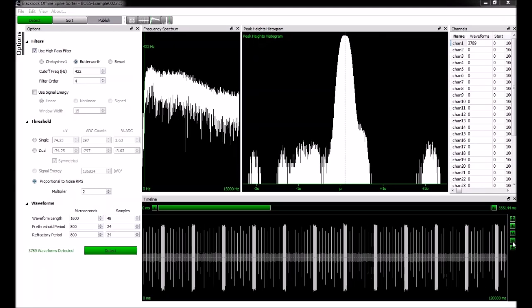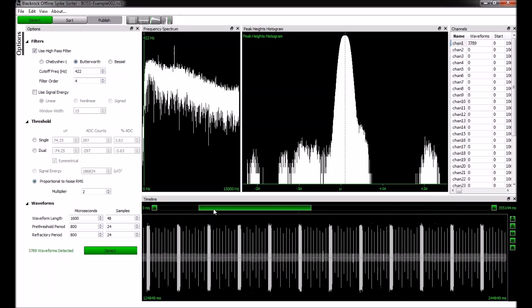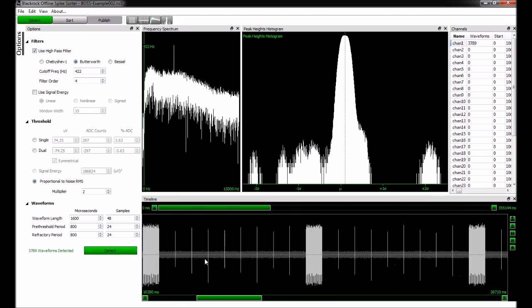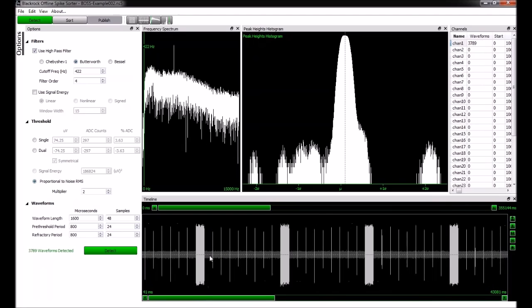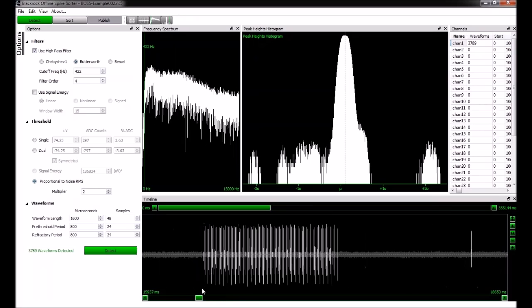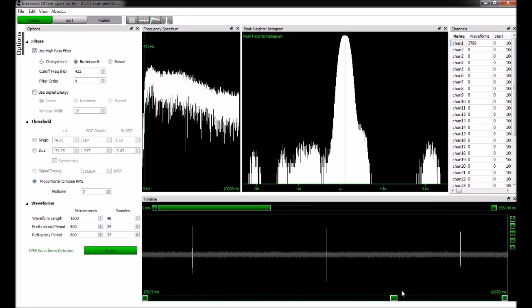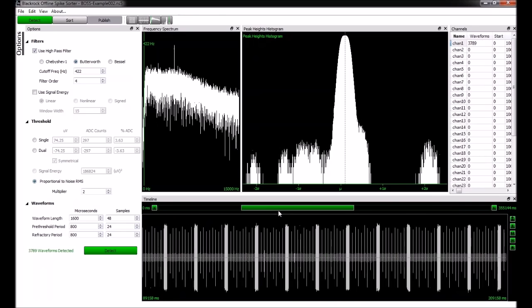Thank you. And somebody asked about the double scrolling and why you have two different scroll bars on the detect window. So I guess you kind of did explain it. So you see, that's one scroll, and there's another scroll on the bottom. The scroll at the bottom is just showing my position within that chunk. I've zoomed into this chunk of the file, and so the one at the bottom is just showing me where I am within that chunk, whereas the one at the top is my navigation through the file as a whole.